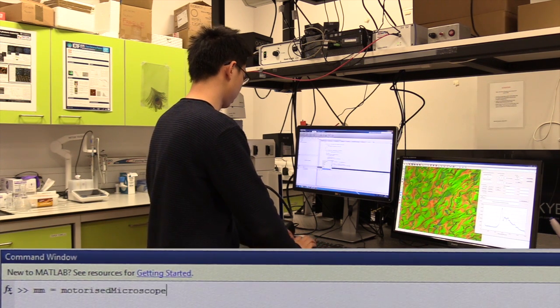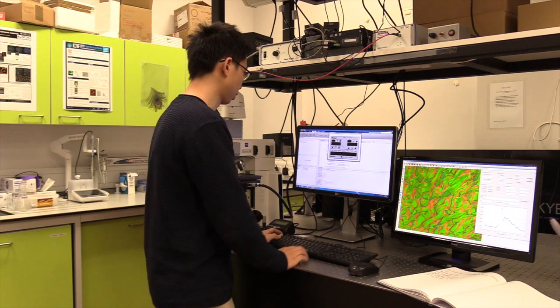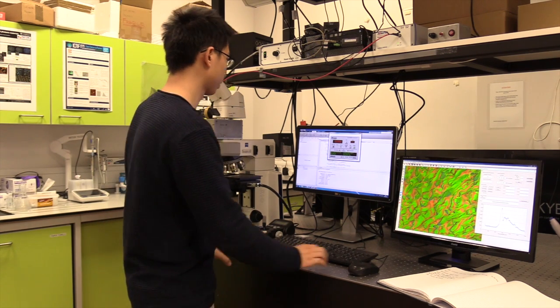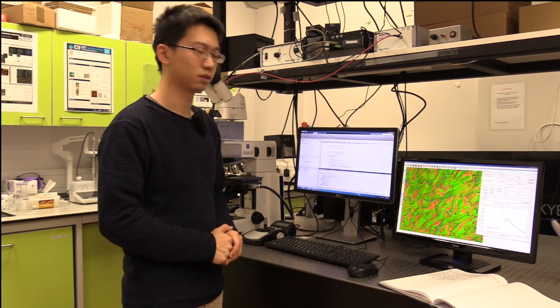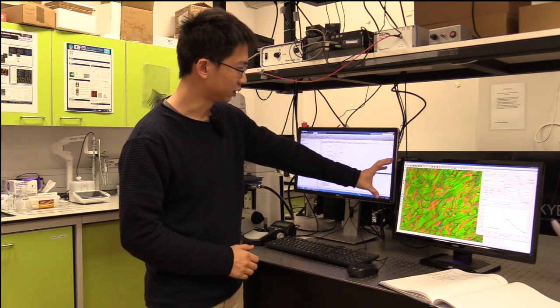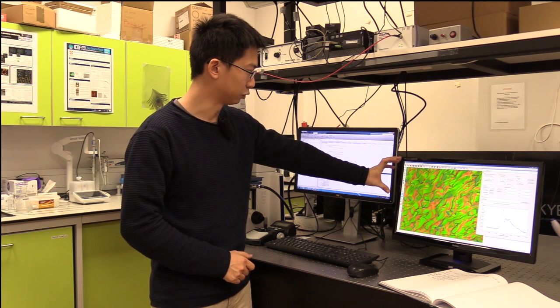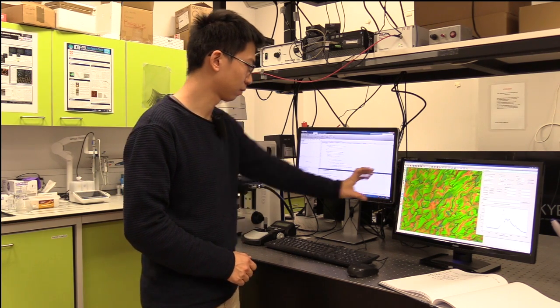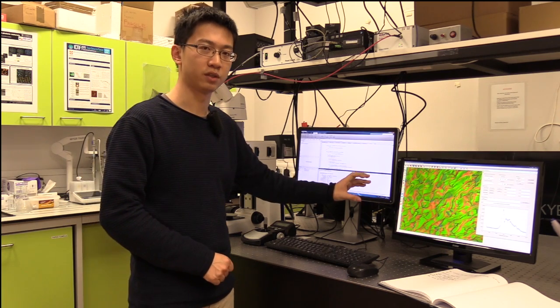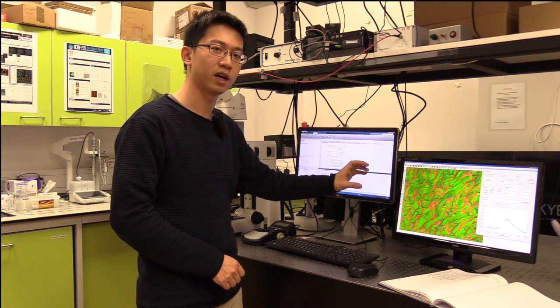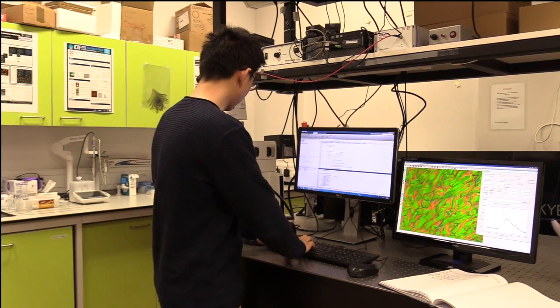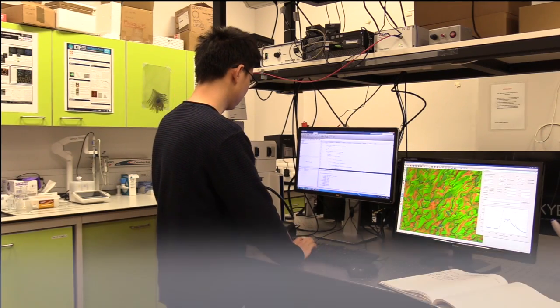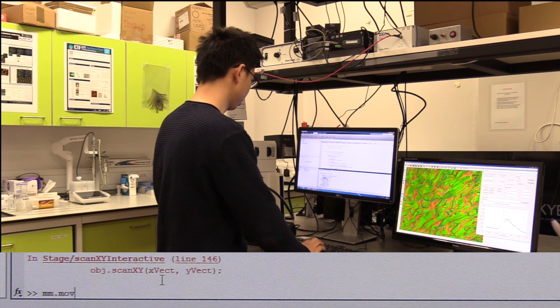The program will initialize automatically. Now let me show you a few useful functions. Here is the camera view of what we are seeing now. The substrate has a left-hand helicoidal structure and it reflects left-hand circular polarized light strongly. And here we have a filter box.